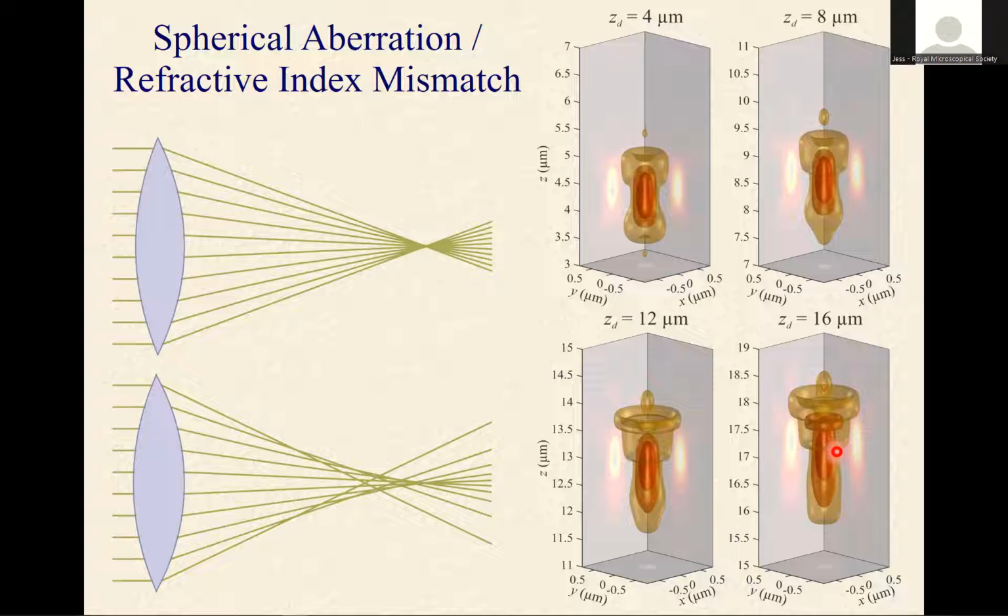also much more accurate. And one way is to use so-called near-field optics or near-field fluorescence. So one very classical method of near-field fluorescence, and I guess you have all heard about it, is total internal reflection fluorescence microscopy, where you excite your sample from the glass side with an incoming light beam at a very high incidence angle. The incidence angle is so big that you have total internal reflection of incoming light on the glass water interface, so you have basically no light penetrating the water side. However, there is still an evanescent field above the glass interface in the water side.